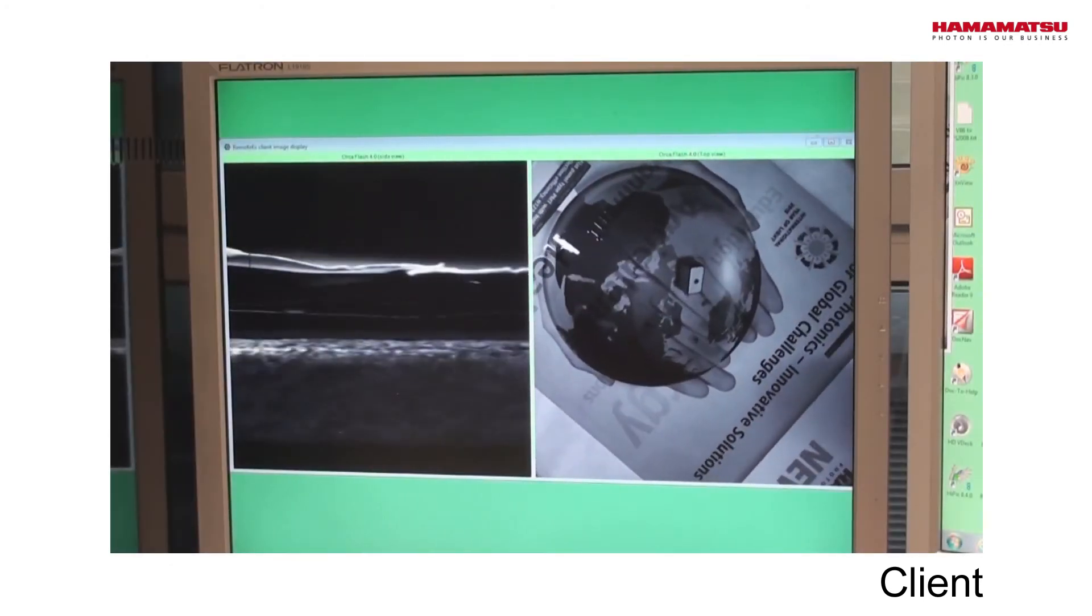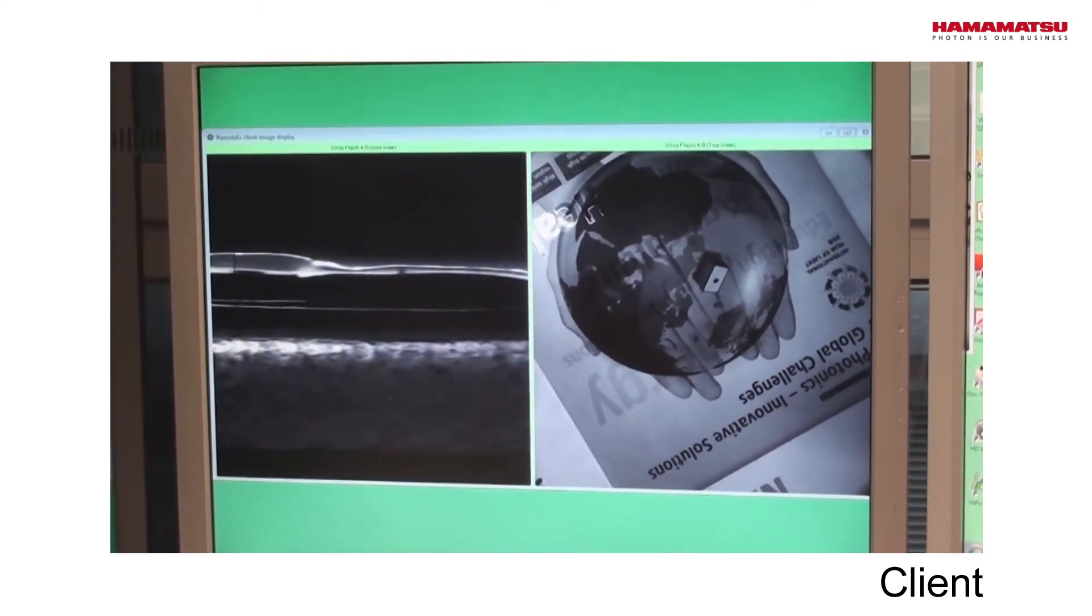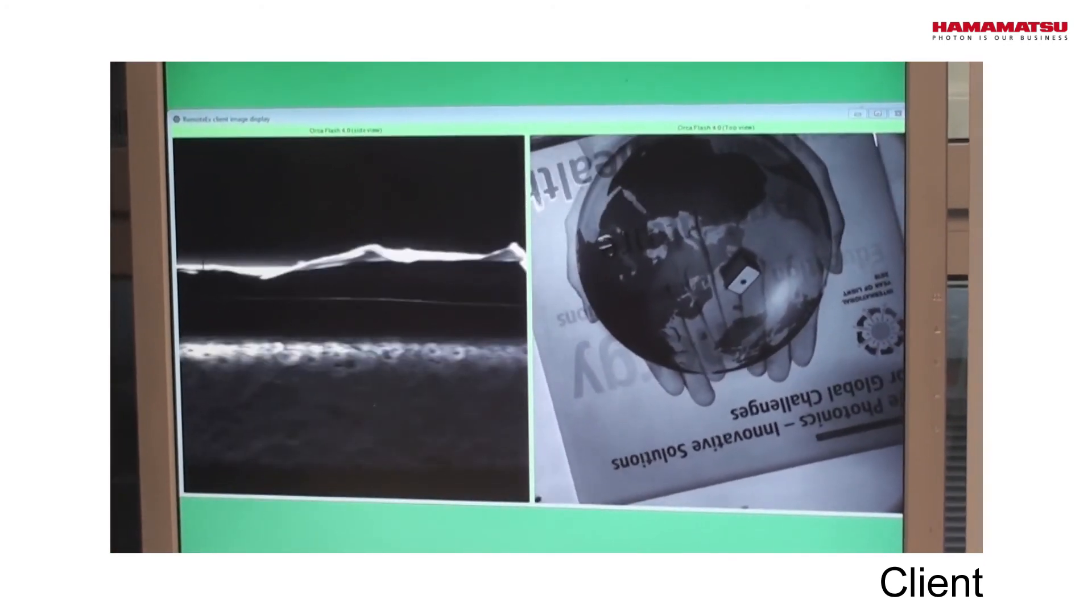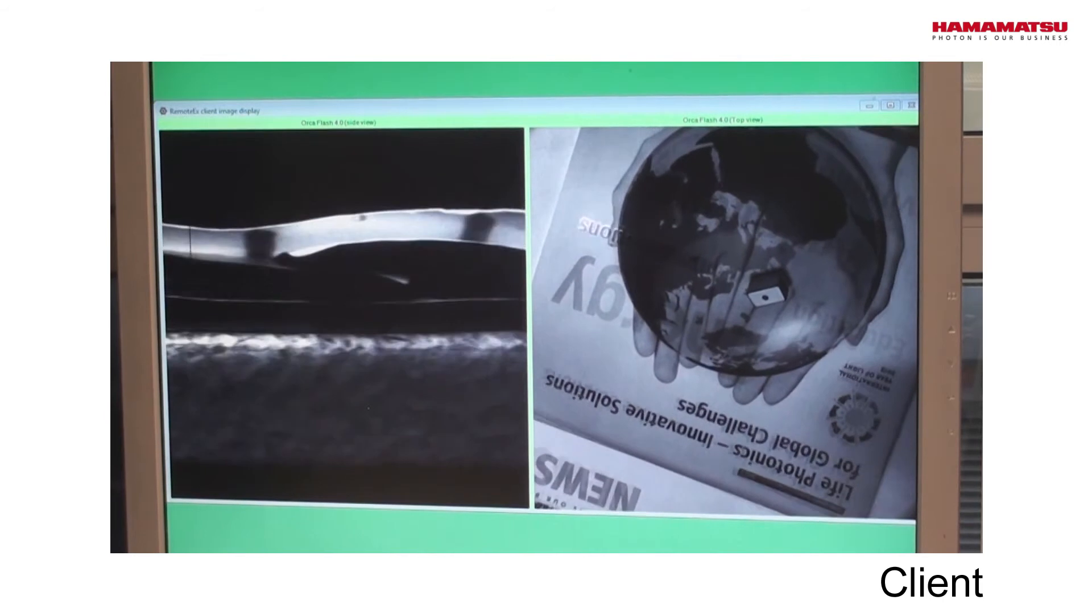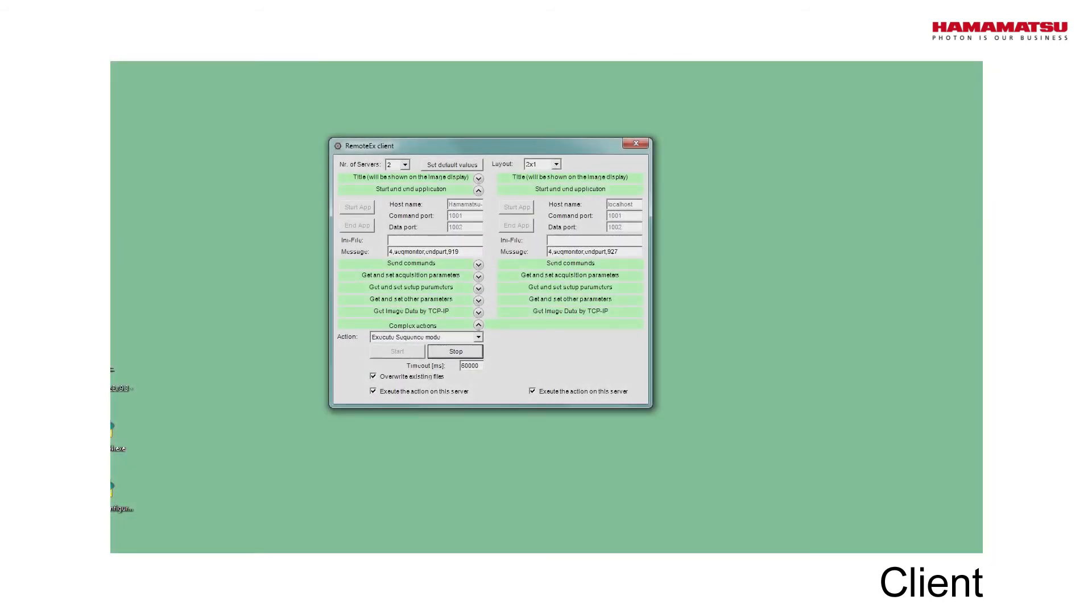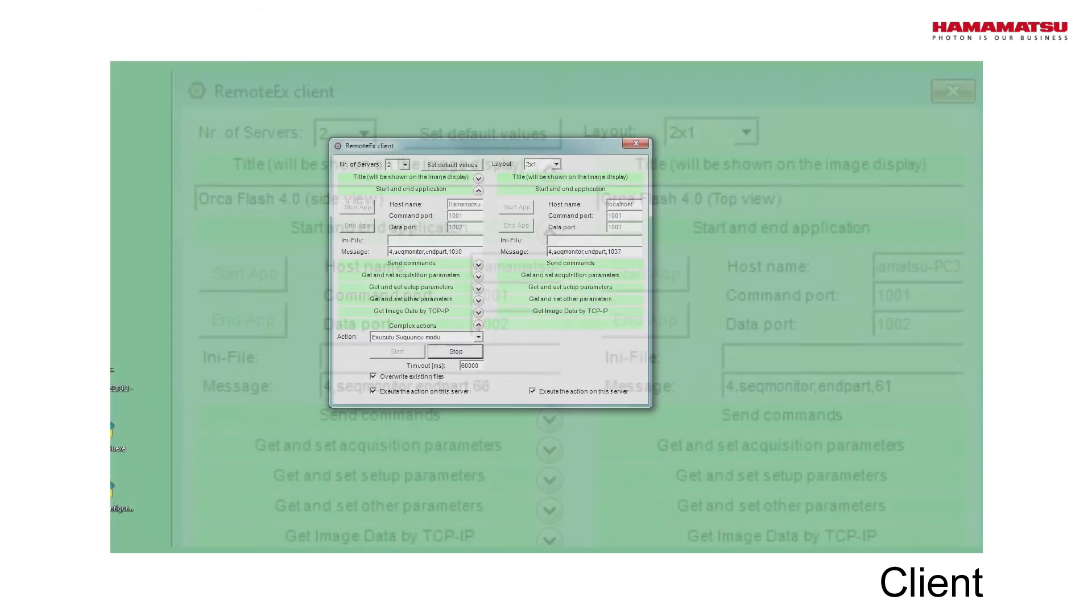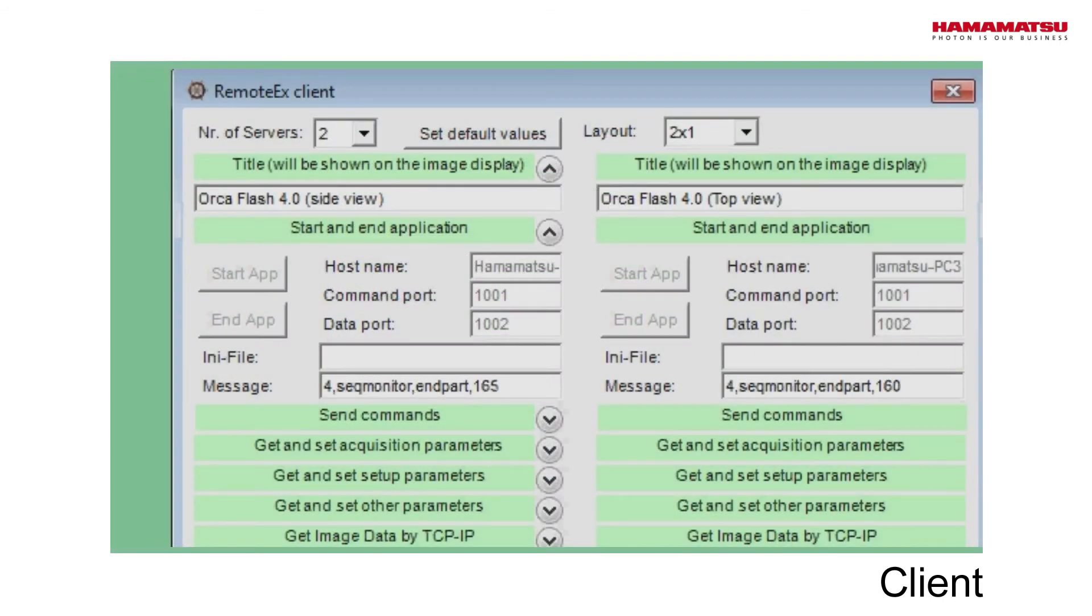After the sequence mode has been started, we can watch the images display on a separate monitor to observe the process of the acquisition on the client's dialog.